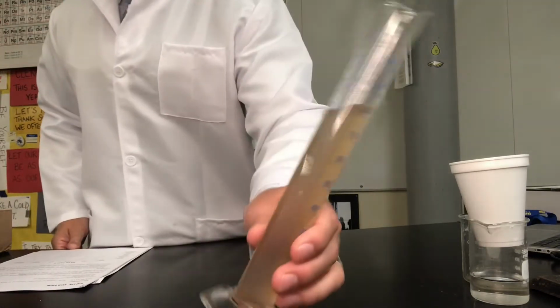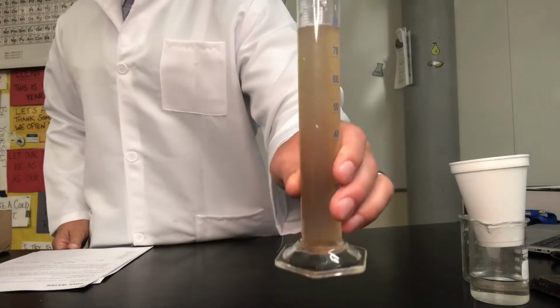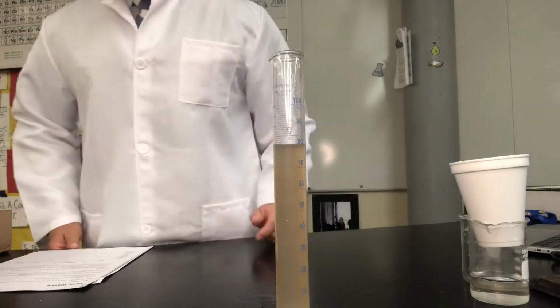Let's take a look at that color. Still pretty much similar, that yellowish brown color. What about clarity?